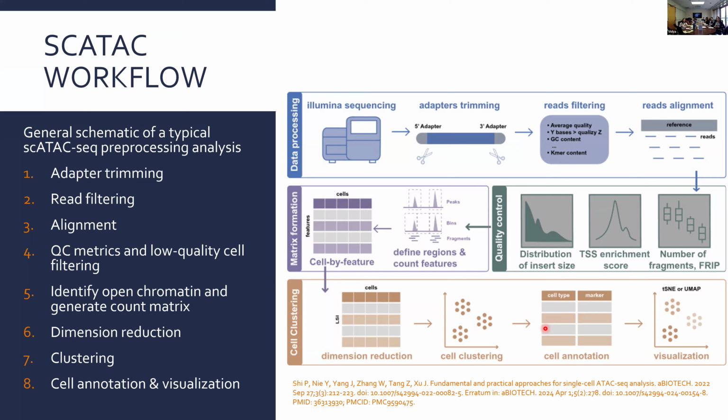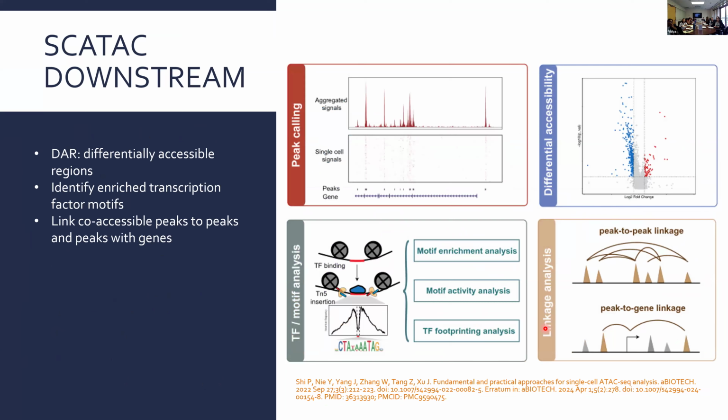So essentially, you're looking at the promoter region and reads that are within the gene itself, and summing that through a cumulative distribution function to say, this is my predicted expression of the gene based on how accessible it is, and it does a surprisingly good job. And I'll show an example of how similar they look with data from single-cell RNA-seq and single-cell ATAC-seq. And then you're visualizing and annotating those cells and doing all the downstream stuff, similar to what you'd be doing in single-cell RNA-seq.